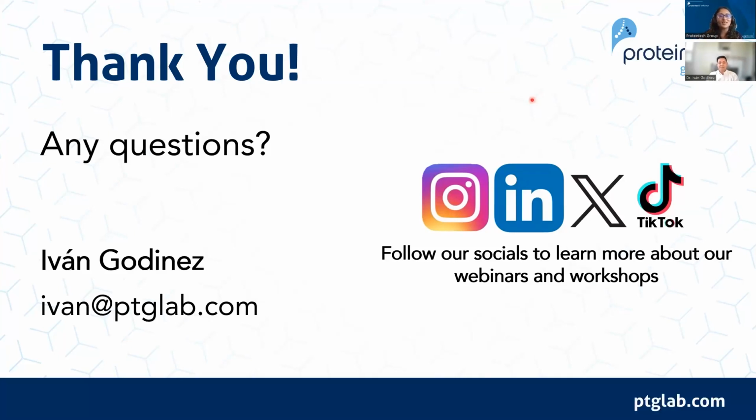Our next question is, is your method also applicable to single nucleus RNA-seq? Yeah, single nuclear RNA-seq is a pretty big area. We have partners that have performed work with single nuclear RNA-seq with our cocktails, and that is something that we are focused on developing in-house as well, but we're not quite ready to share our data. So the short answer is yes, we will be releasing any single nuclei associated antibodies pretty soon. So stay tuned.